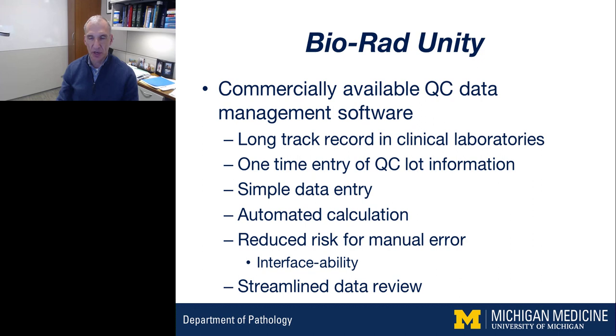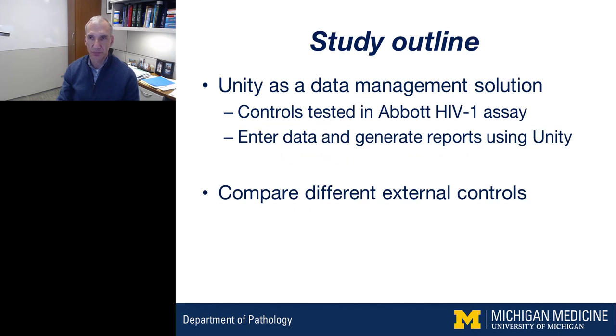And we're just starting the process with Bio-Rad to establish interfaces with our Abbott instrumentation that we perform viral load testing on. Because of the nature of the software, the data review is very streamlined, and I'll show you examples of some of the reports that are generated and used for review.